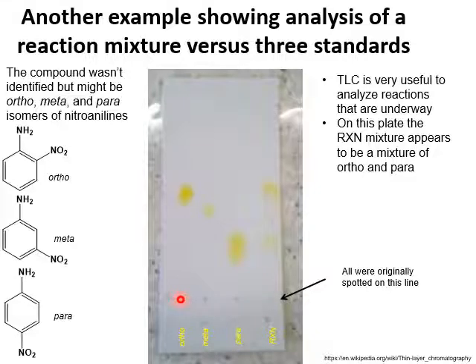And then after you put it in your elution chamber, the solvent will pull itself across the surface upwards because it's trying to evaporate, and because of the cohesive nature of the solvent system. TLC is very useful to analyze reactions this way.